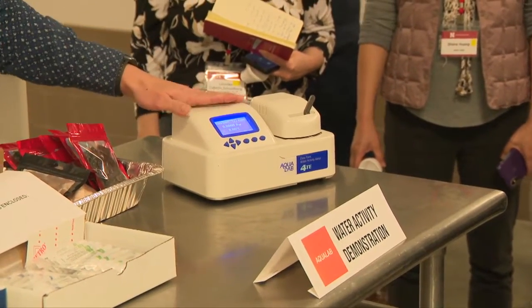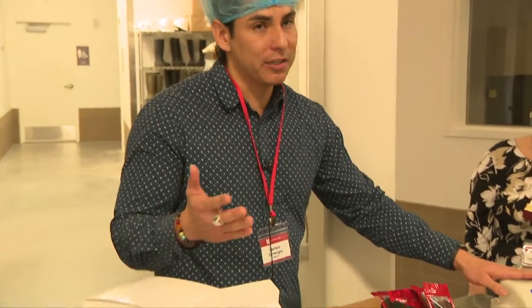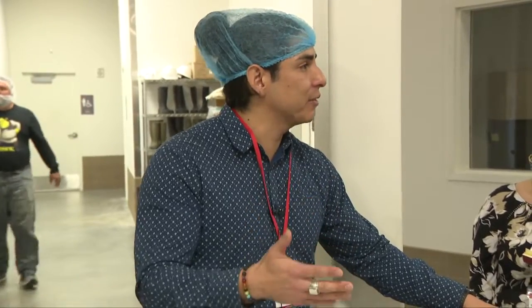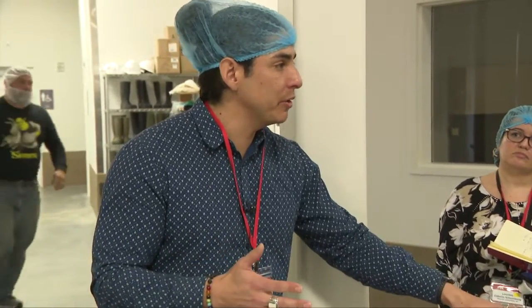Water activity is something that some people in the pet food industry use, but I still see a lot of companies not using this measurement yet because many are more familiar with moisture content. Moisture content is a quantitative amount of water. A lot of companies we work with are always trying to maximize their yield and revenue, so they try to have as much water in products as possible, but they rely on moisture content when they should really be using water activity.